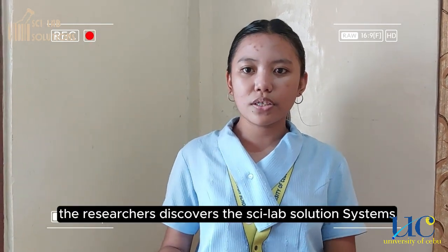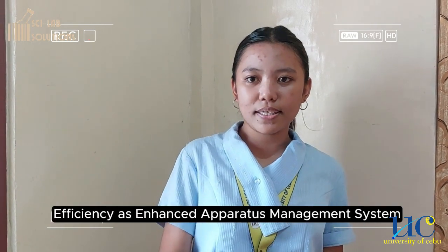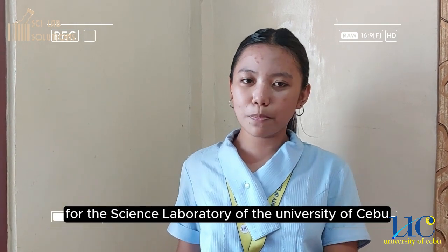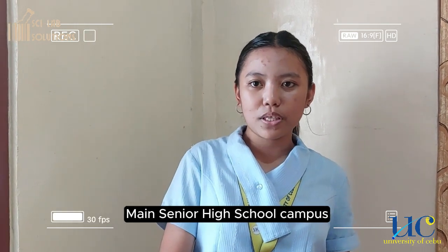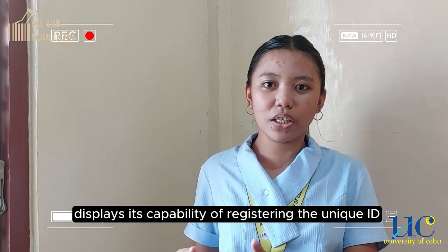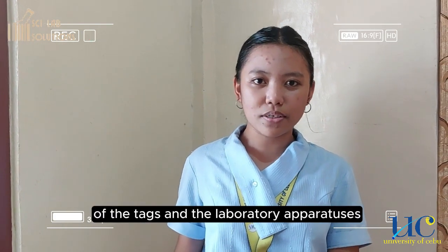Through a survey, the researchers discovered the Scilab solution system's efficiency as an enhanced apparatus management system for the science laboratory of the University of Cebu Main Senior High School campus. The Scilab solution system displays its capability of registering the unique ID numbers and the barcodes of the tags and laboratory apparatuses.